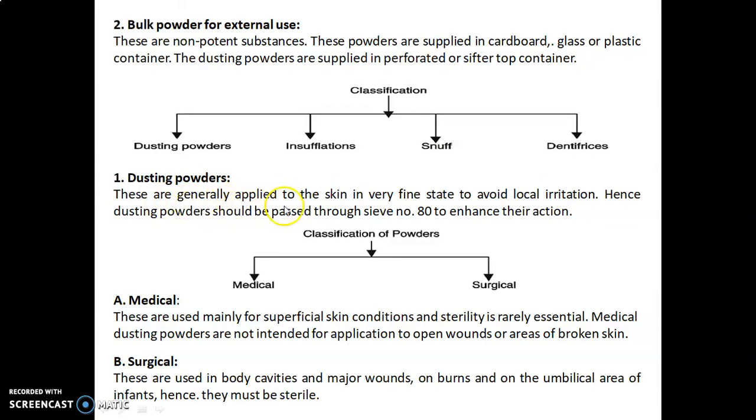These are generally applied to the skin in a very fine state to avoid local irritation. Hence, the dusting powders should be passed through sieve number 80 to enhance their action. Classification of dusting powder is medical and surgical. There are two classes. We will discuss the medical one.